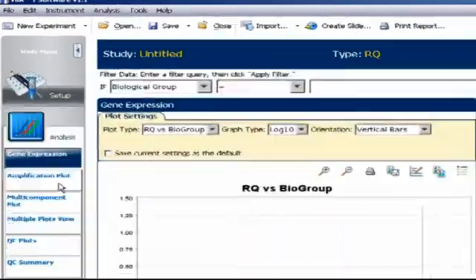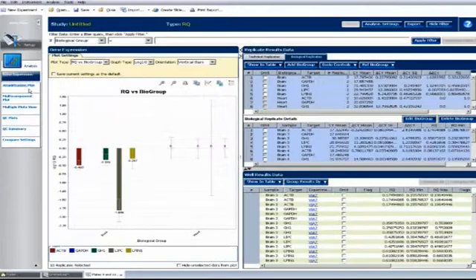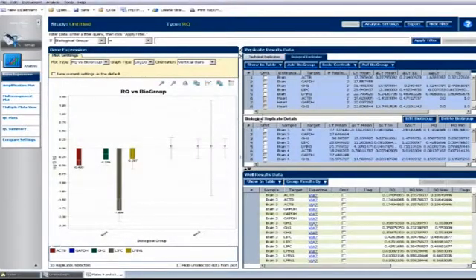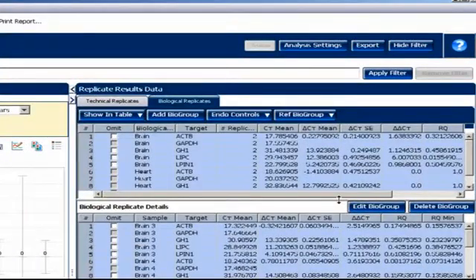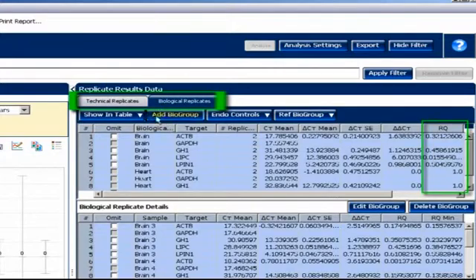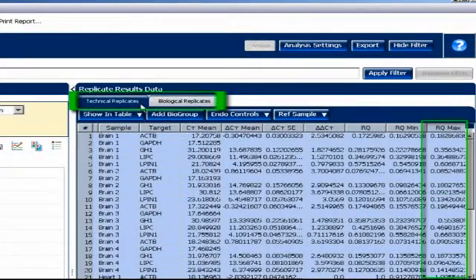We would then go to Results, where we'd find that the study had calculated full fold change data for us. In fact, it's performed calculations on both the technical replicates and biological replicates.